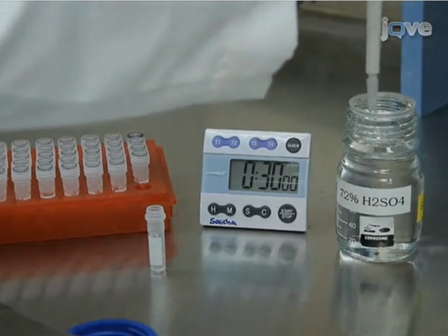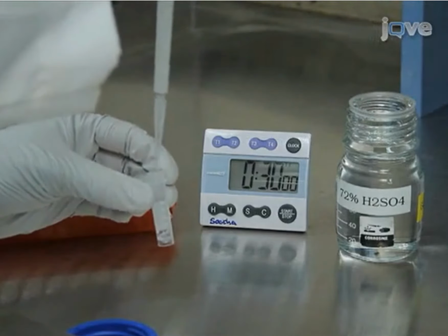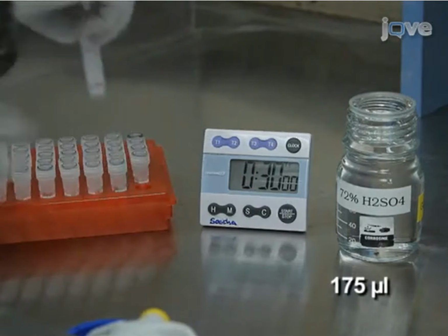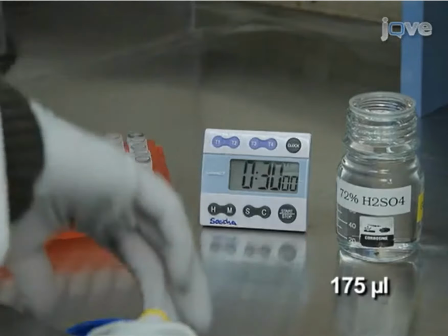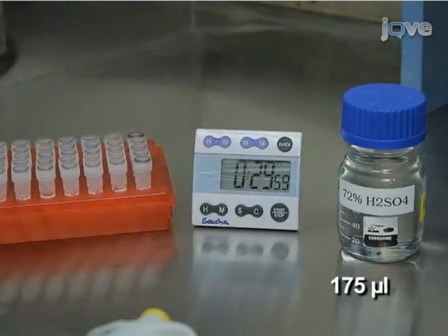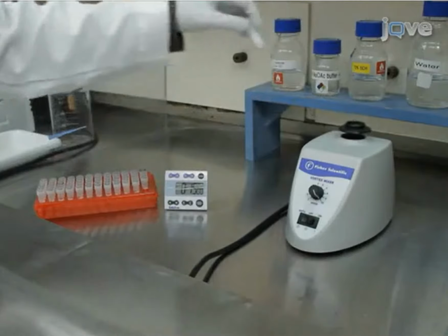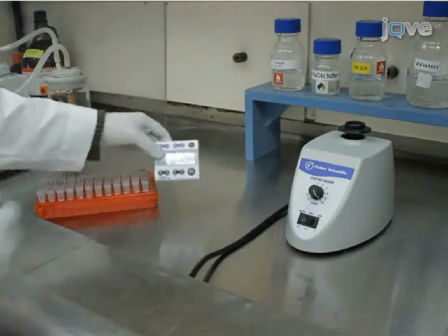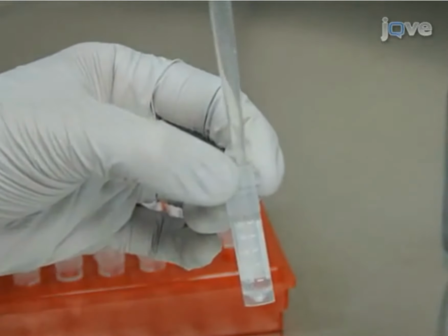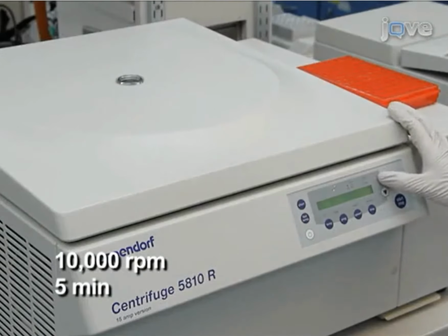Next, perform a Saeman hydrolysis with the concentrated sulfuric acid in order to completely hydrolyze the crystalline cellulose pellet into glucose. Start by adding 175 microliters of 72% sulfuric acid to the Safe-Lock tube and incubate for 30 minutes at room temperature. After the initial incubation, vortex the sample and incubate for another 15 minutes. Then, add 825 microliters of water and vortex, and centrifuge the samples at 10,000 RPM for 5 minutes.